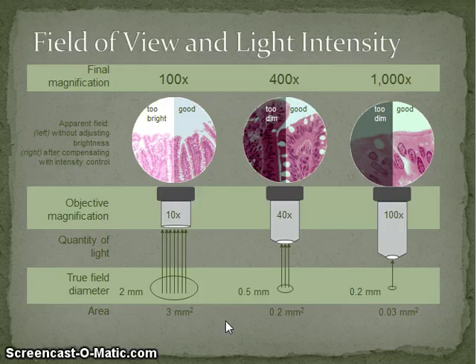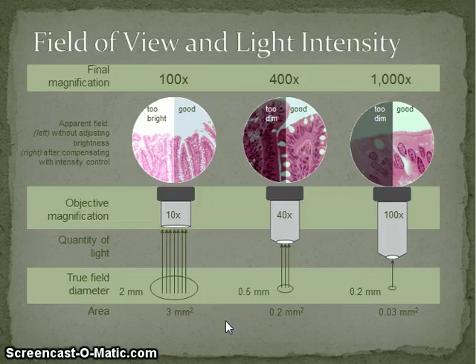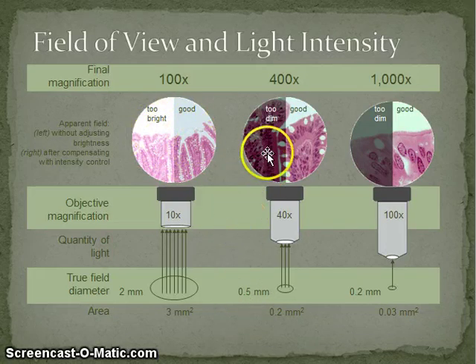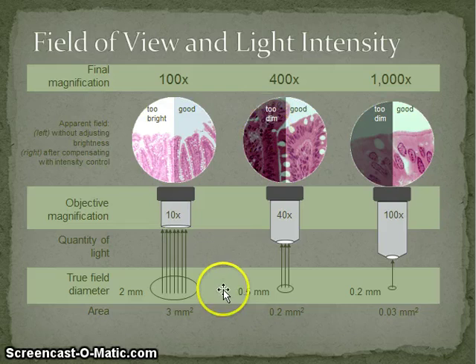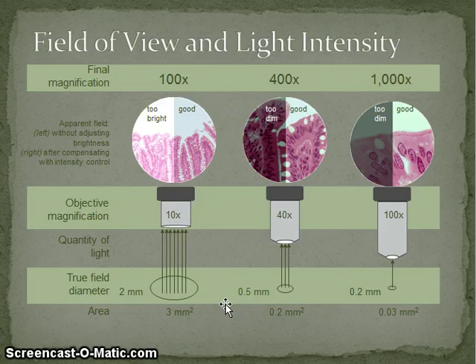Just a quick aside: it's very difficult to identify structures clearly if your lighting is not correct. Too bright is bad, very good is the middle setting, and too dim is also bad. If you don't have the right lighting, it's very difficult to calculate things correctly, so make sure that's sorted.